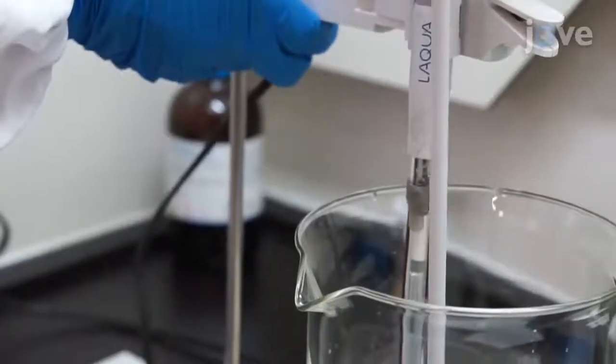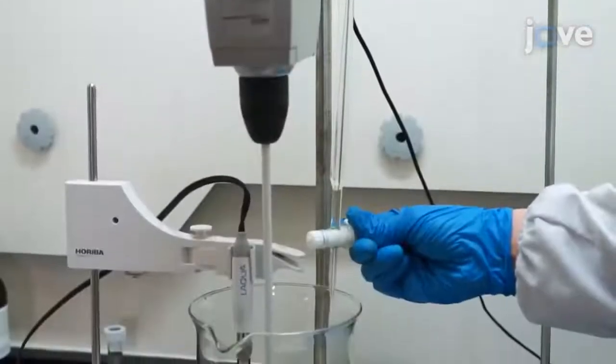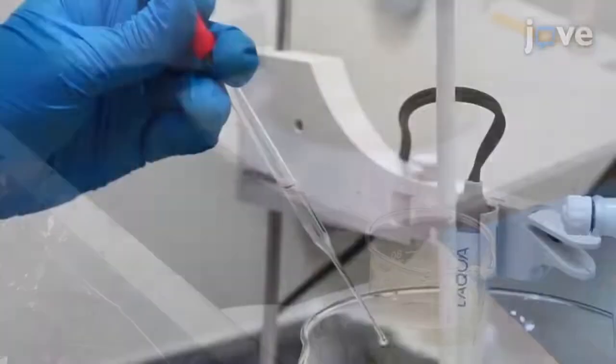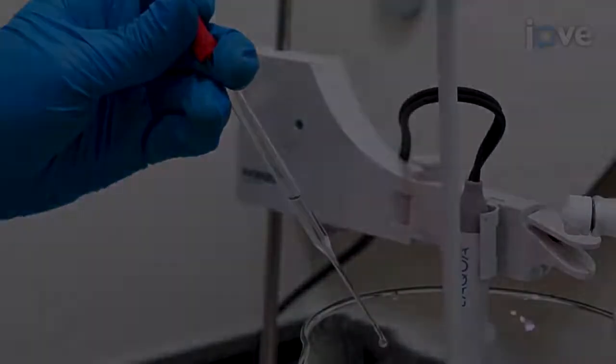Begin continuously monitoring the pH of the mixture with a pH meter. Adjust the mixture pH to about 10.5 with a 3 molar sodium hydroxide solution. Then, over the course of several minutes, slowly pipette into the suspension 63.8 grams of aqueous sodium hypochlorite with 6 to 14%.